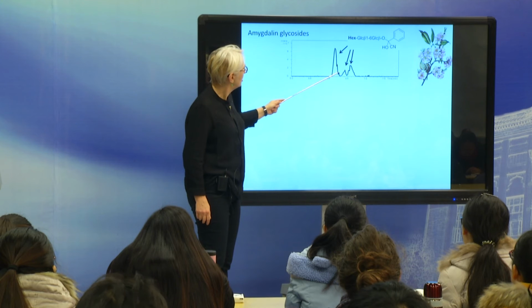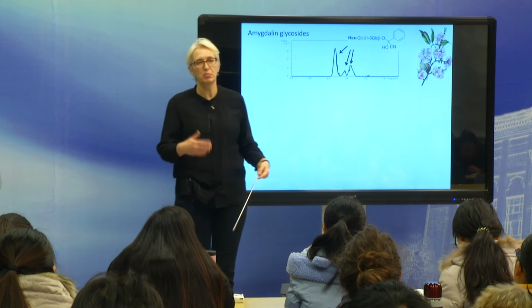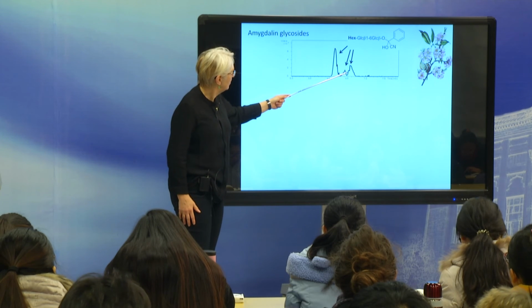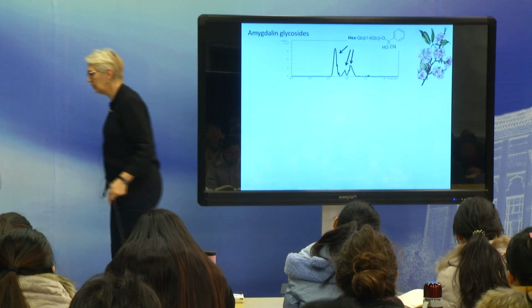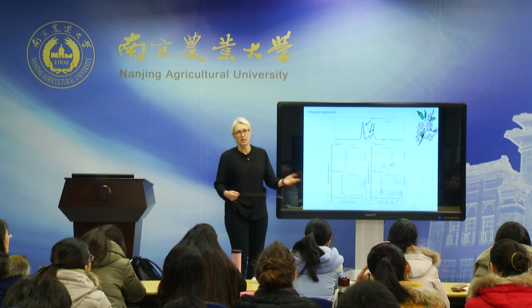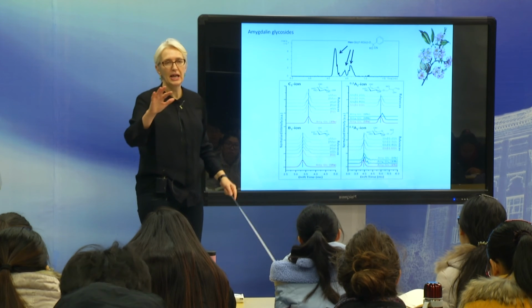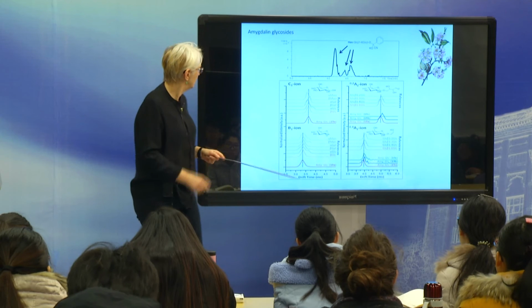But they had no idea what the hexose was, what the linkage was, or whether it was alpha or beta linkage. And obviously if you want to publish these structures, quite tricky. You say, well, that's it. And also, you can see the noise is quite high. They really didn't have enough material to isolate those. So we used all these ion mobility technologies. We had already, because we generated a lot of standards, all the data on fragments we can obtain if you had a mannose there, if you had an alpha mannose or beta mannose there, or galactose or glucose, all the possible hexoses. We had very simple standards from other experiments, which were already in the database.